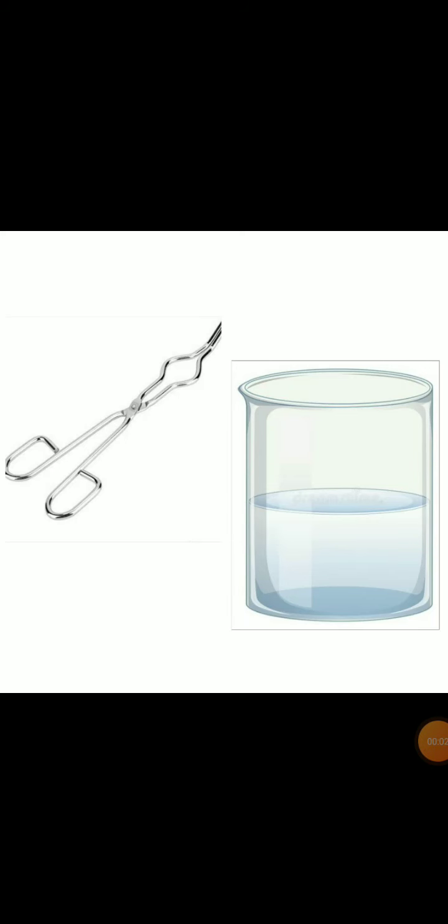Let us learn another chemical property of metals, and that is what happens when metals react with water. For that, we need to perform an activity for which we will require samples of the metals. We will take samples of the metals which we have taken for the previous activity. The samples you can take are aluminium, copper, iron, lead, magnesium, zinc and sodium.